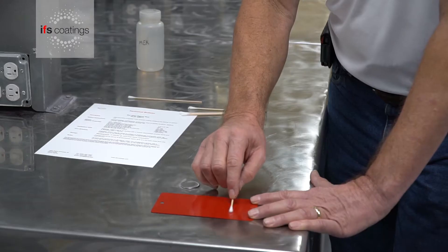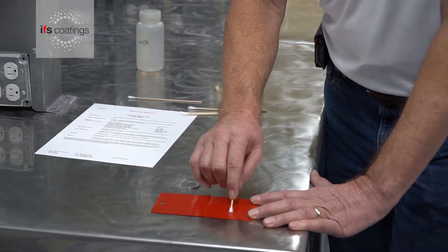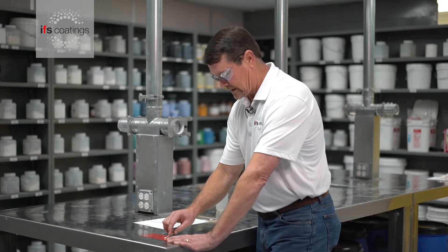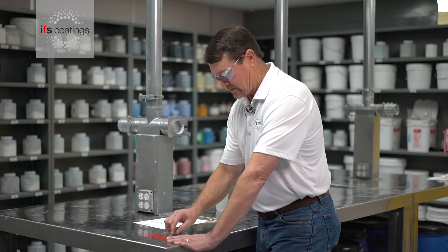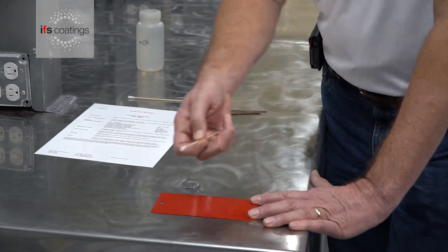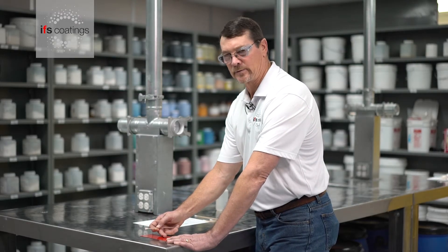I'm starting the test right now. As you'll see, there is just a slight rub off. We didn't break through the film going back down to the substrate.